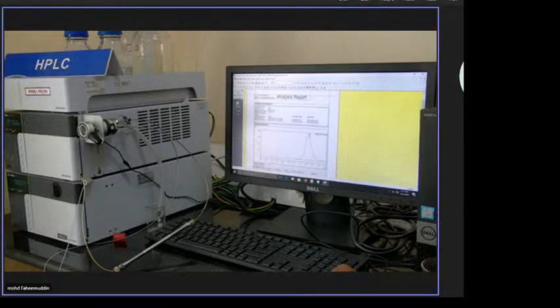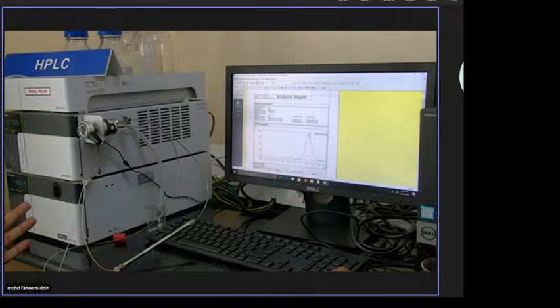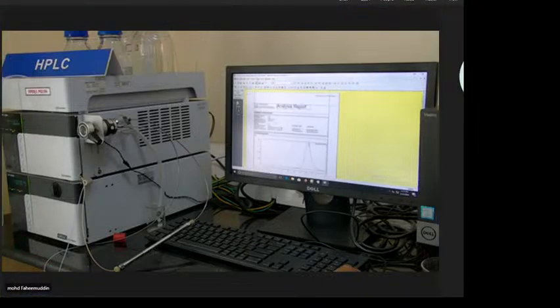So this is how we can give the sample information. You can write your name, your college name, date, everything will come, and standard sample 1, 2, 3, 4 like this, and take the printout of all these things and attach it. Okay.